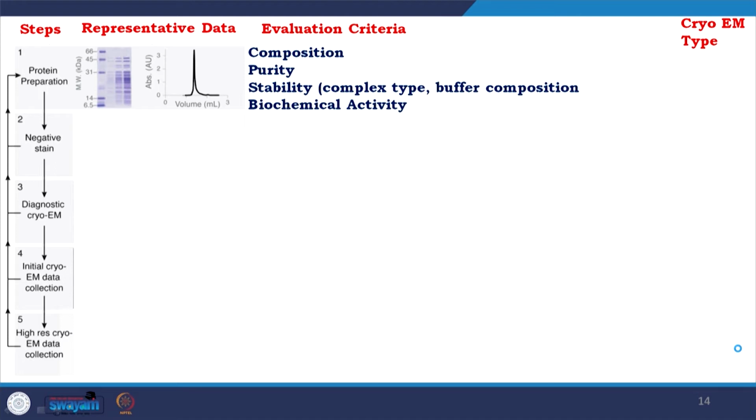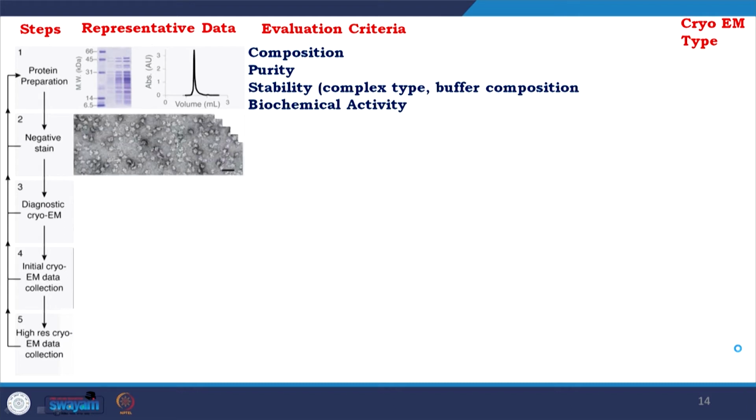Here the evaluation criteria would be the composition in the mixture, the purity if a single protein is used, the stability, where the complex type, buffer composition, and then the biochemical activity.